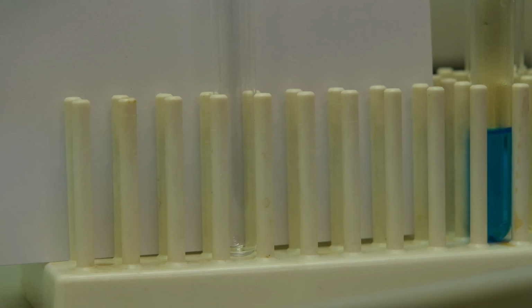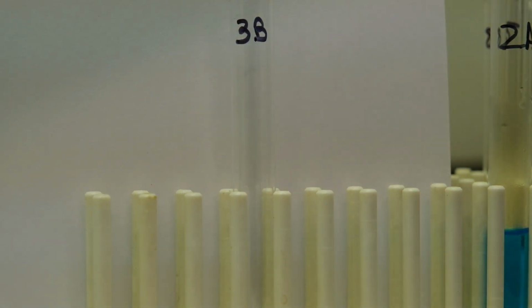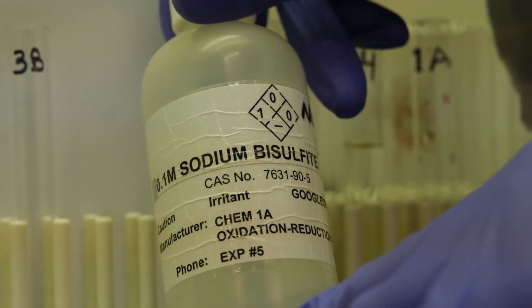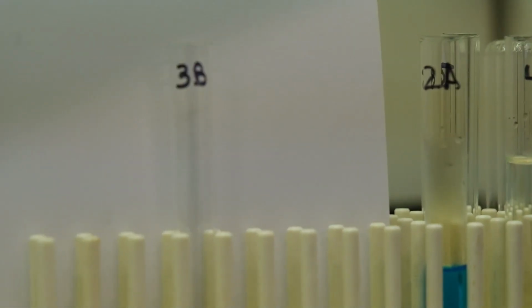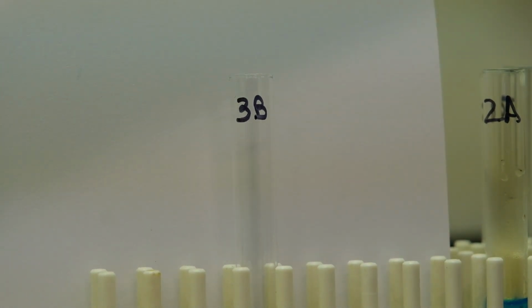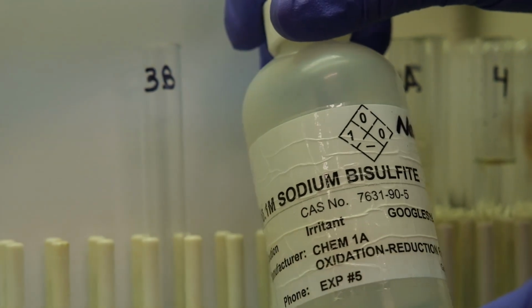This is experiment 5, system 3B. We're going to add approximately 2 milliliters of 0.1 molar sodium bisulfite.